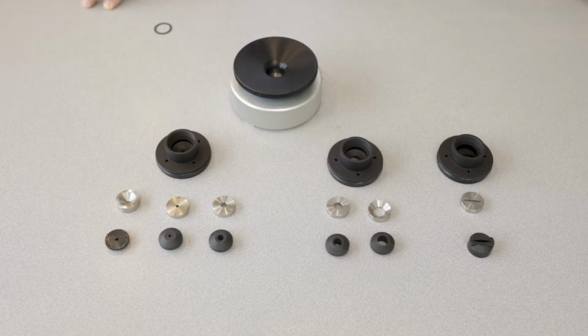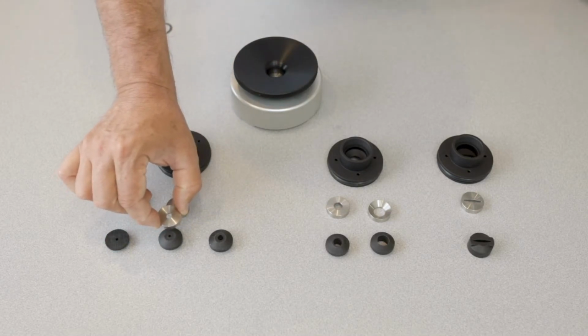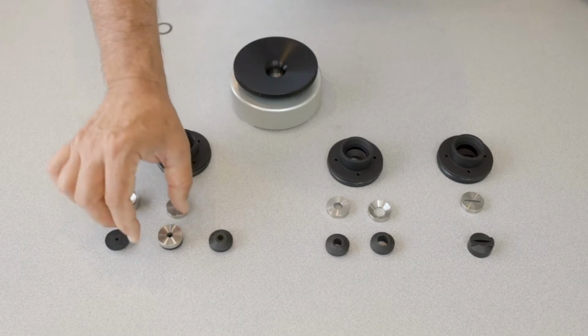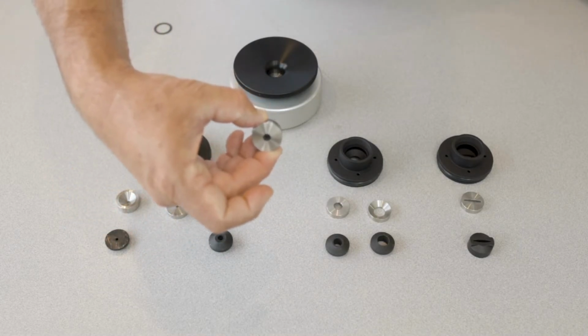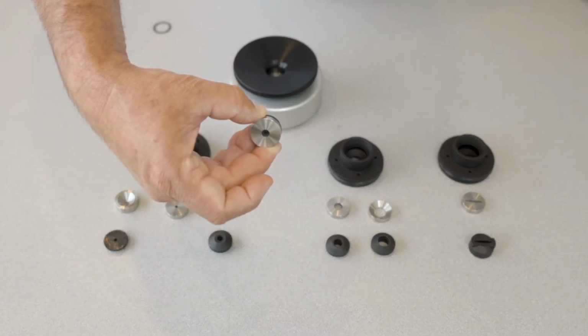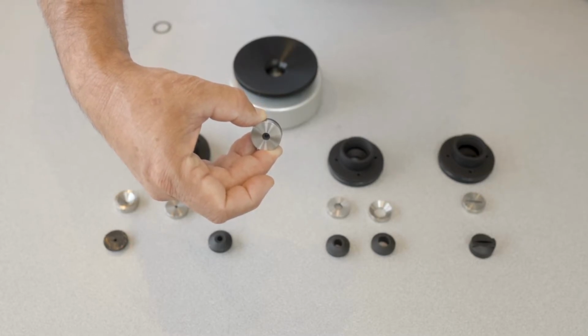Now there is another option that we do occasionally do, and that's with a 1/4 inch insert and an 1/8 inch gasket. We call that a hybrid system. And why we do that is it allows you to, if you can see right down in that hole, you can use a little shorter petiole and still get just buried, clear of the gasket and able to see the end of the petiole there.